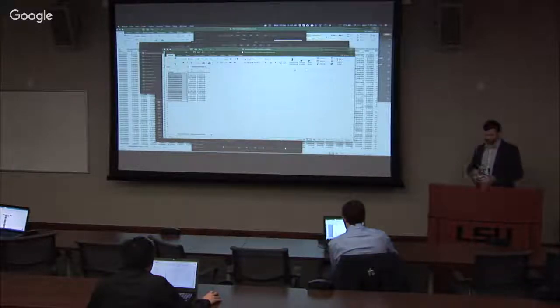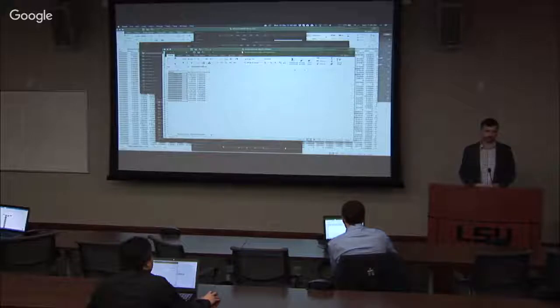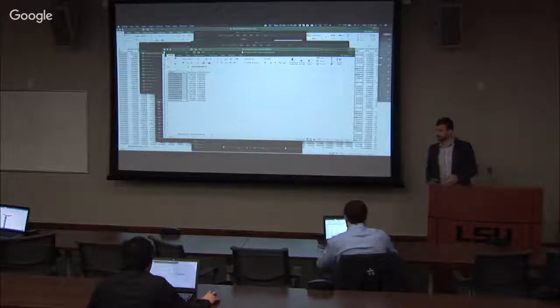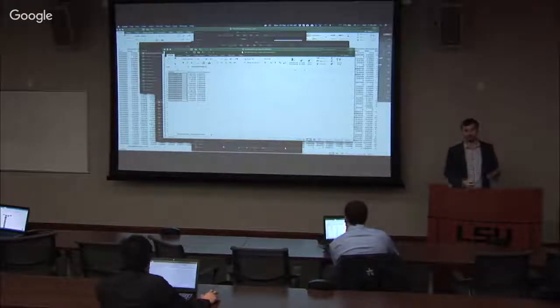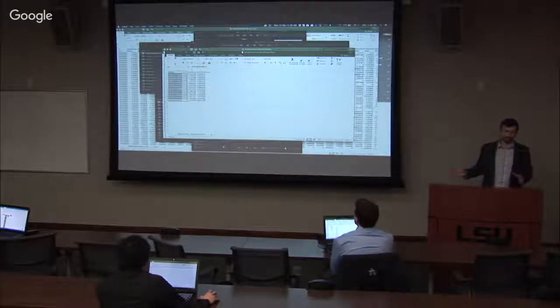So what I can do is now go back to using clustering to create a data set from these genes that are all going to be clustered similar to the genes that I've selected using Random Forest. So now I can go back and take my original expression table, plug in only the 15 genes that I have right here, and consider different methods for clustering that are now going to be looking at the same variability, but based on the genes and not the samples. So don't do transpose. Okay?